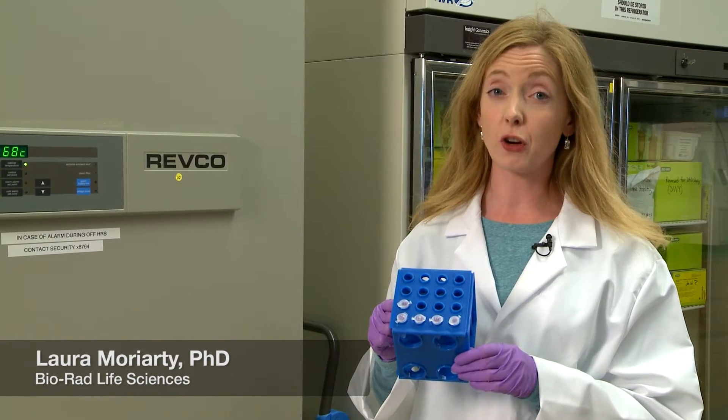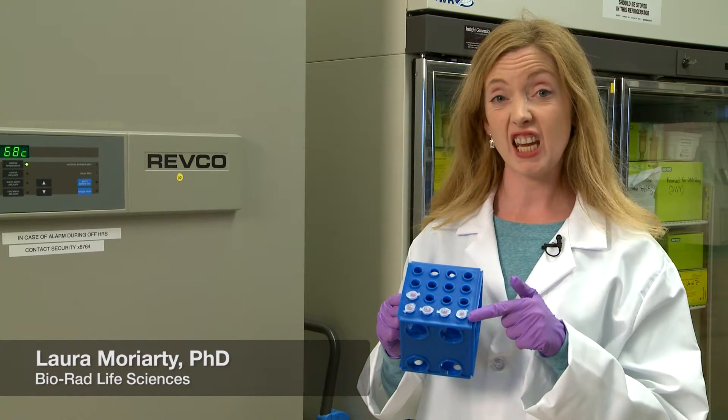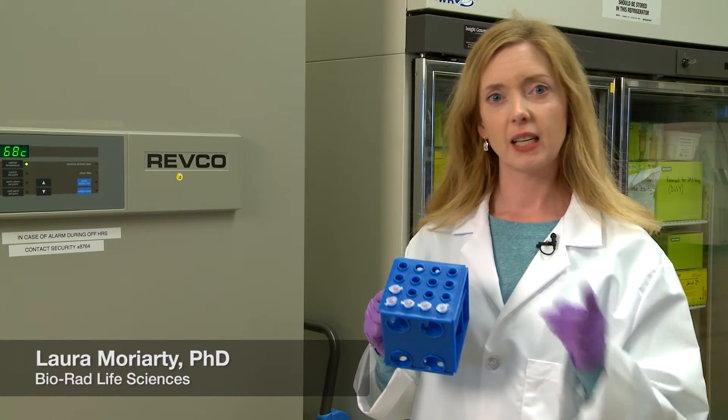Wow, you've had a busy week purifying your precious protein, and here it is. But how do you store it? Here's a couple of tips.